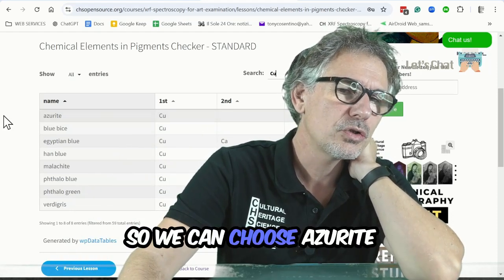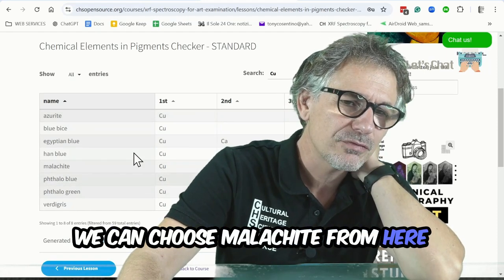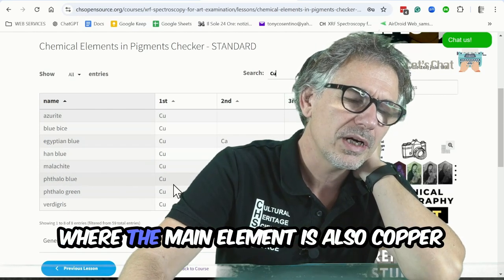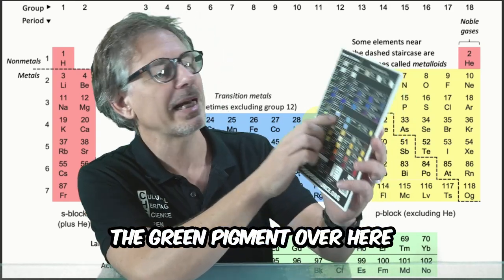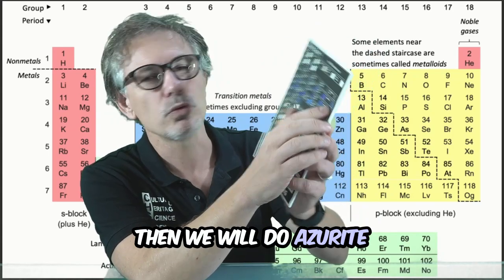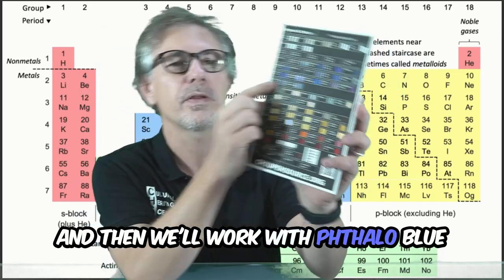We can choose azurite, we can choose malachite from here, and also from here I want to choose phthalo blue, where the main element is also copper. We start with malachite, the green pigment over here, then we will do azurite, and then we'll work with phthalo blue.